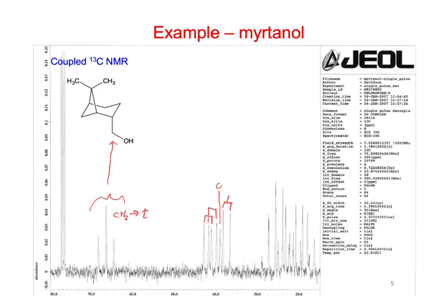We have more peaks right there. Right, so there's 3 doublets because those are CHs. Yeah, and then maybe somewhere in here, something is probably a quartet.